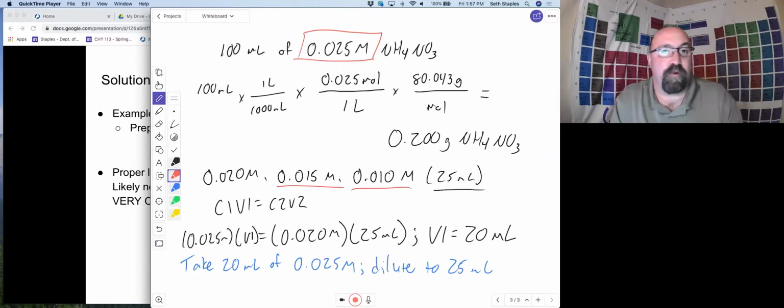As far as a mixture, you'll be mixing together some CaCl2 and some Na2CO3. That's the one that we're exploring for our precipitation exploration. So you'll get the conductivities of each of those separately and then mix them together and find the conductivity of the resulting solution. Again, that's for the CaCl2 and the Na2CO3.